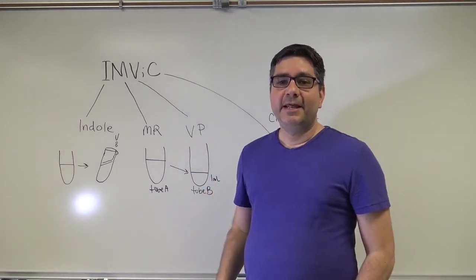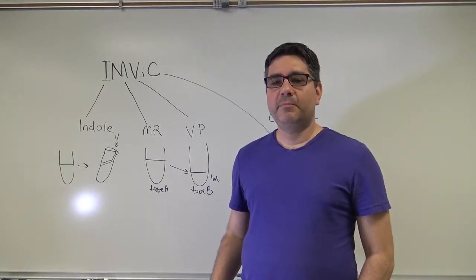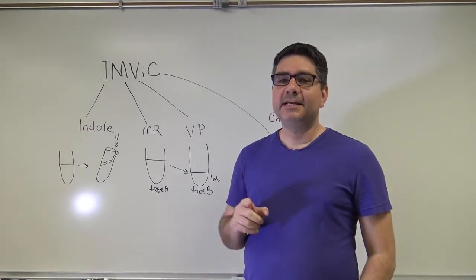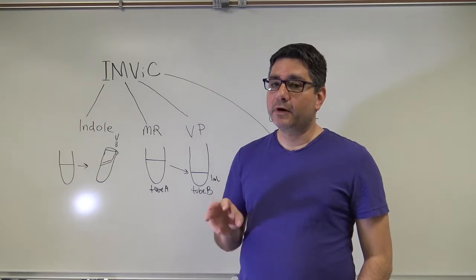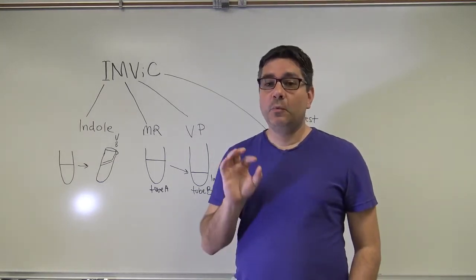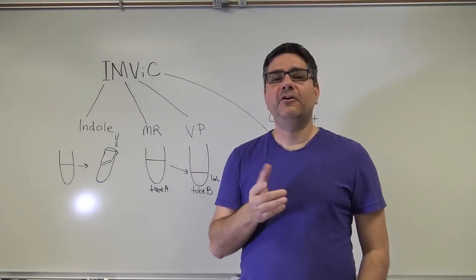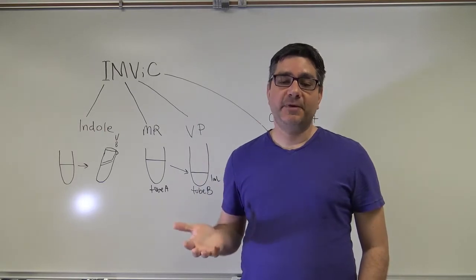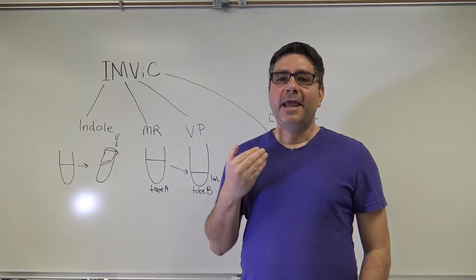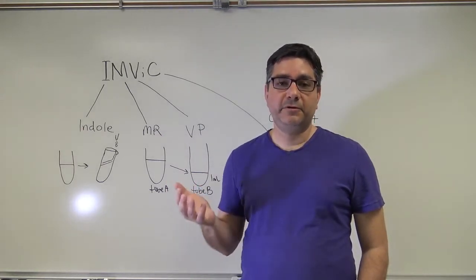To illustrate an important concept today, we will also be testing an organism in a 1% tryptone, 1% glucose broth tube. The purpose of this is to highlight the fact that microorganisms, like us all, prefer to take the easy way out. With this test, you will notice that the organism will prefer to utilize the glucose over the tryptone in the culture medium. This will result in little to no indole production and a brownish color instead of the typical reddish color you get from indole production.